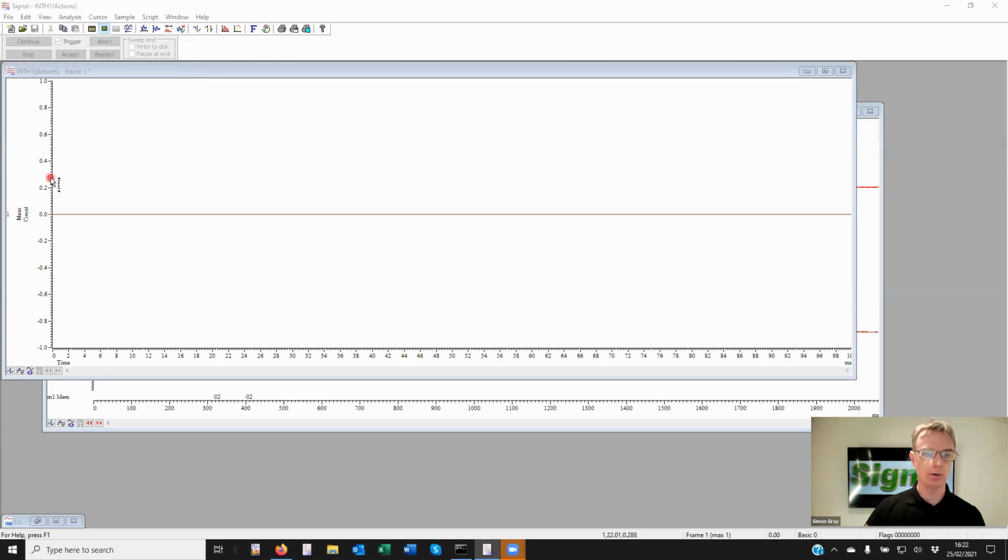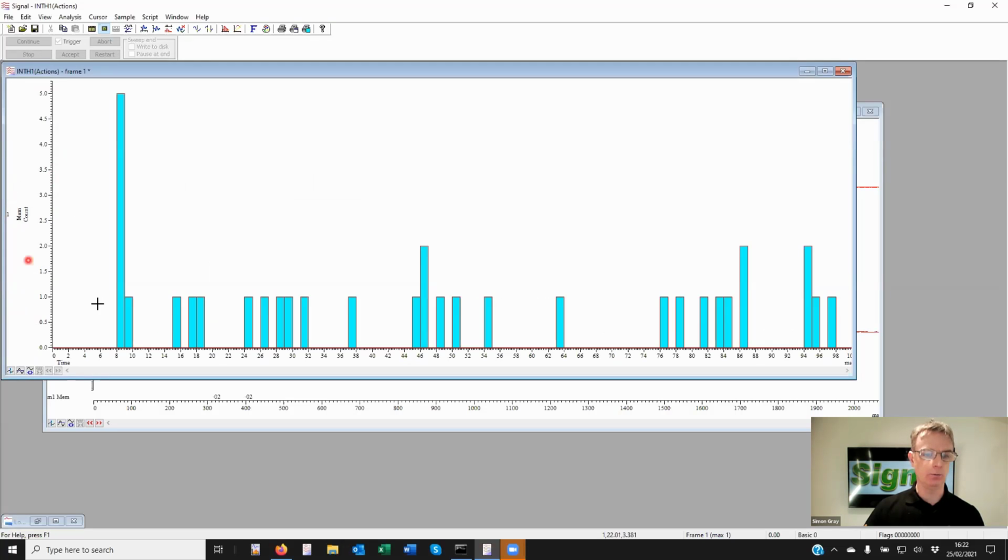And if I process those, you can see we've got quite a few intervals that are 8 to 9 milliseconds. The rest is dotted along various other intervals in our file.